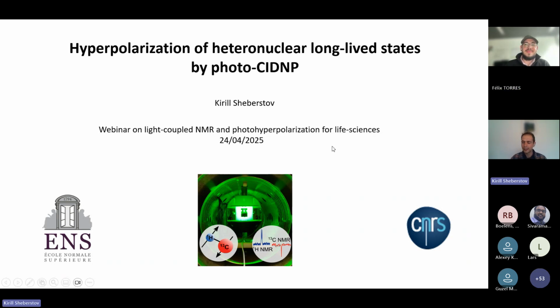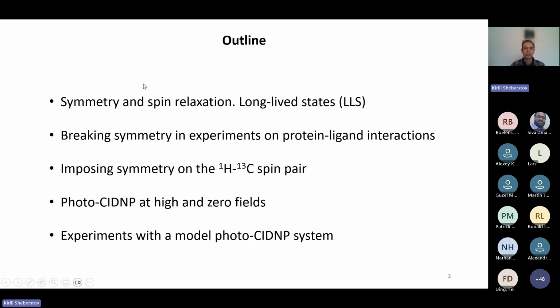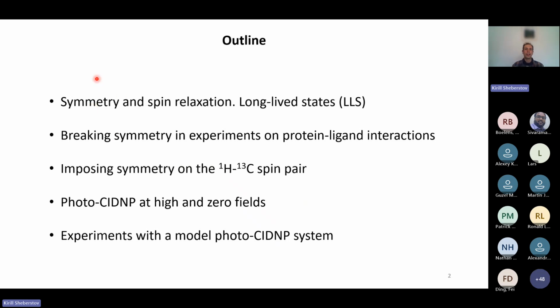Thank you, Felix. I would like to thank you for this invitation and for the opportunity to present our work, which indeed will be on hyperpolarization of heteronuclear long-lived states by photo-CIDNP. So the key notion of my presentation will revolve around symmetry. For example, how symmetry can determine spin relaxation, providing a background for so-called long-lived states, which Lars Kiryutin mentioned in the beginning of this nice webinar.